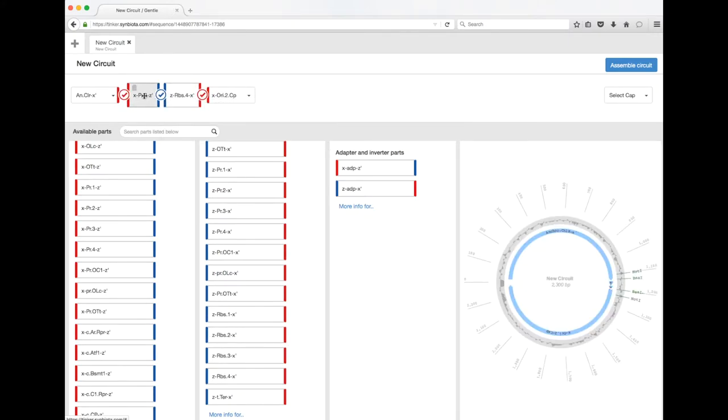Similar to the promoter, ribosomal binding sites have different strengths. The lower the number means weaker transcription or translation; the larger the number means stronger transcription or translation. So if you want the cell to express a lot of the protein, you'll want a four. If you want just a little bit, use a one, and anywhere in between is fine.